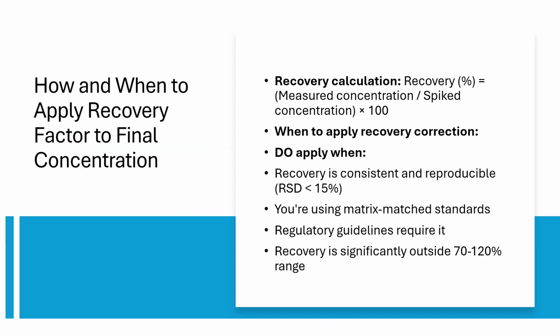Recovery studies determine how much of an analyte we can extract and detect from a matrix. So therefore it is important that you know how to calculate the recovery. Recovery percentage is equal to measured concentration divided by spiked concentration times 100. And when to apply recovery correction?